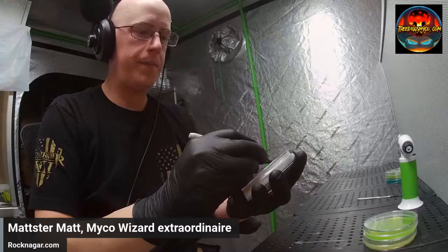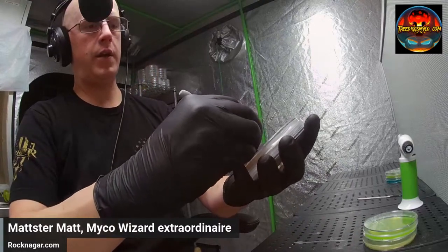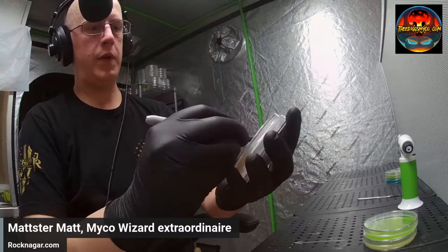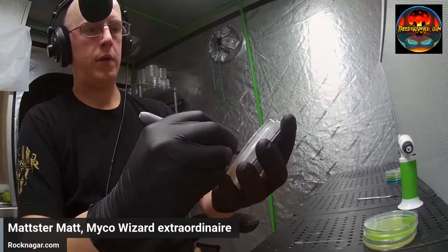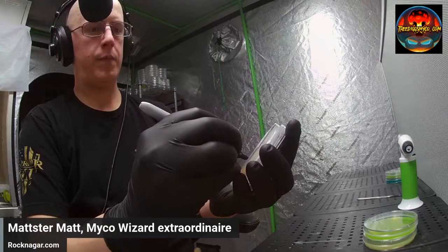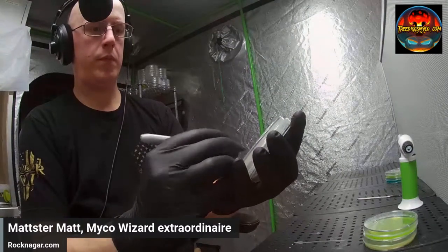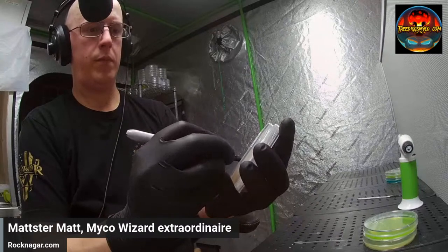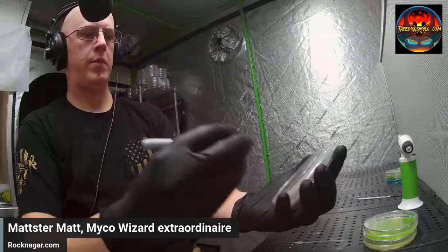The permanent marker doesn't come off as easy when it's dry. You can hit it just a little bit harder and not erase all your lines. Mostly.